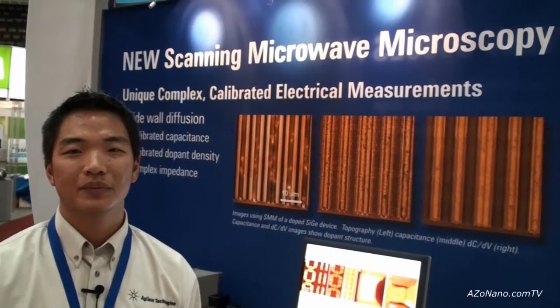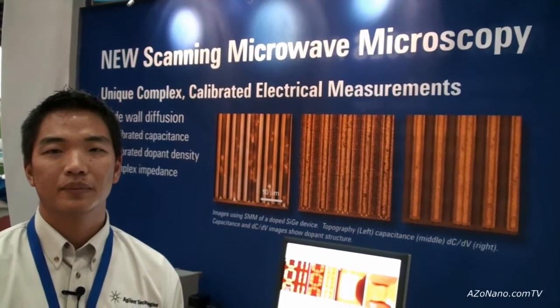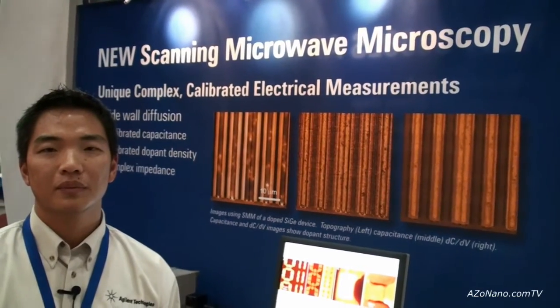This is Cameron Chai from azonano.com, speaking to Gil Min from Agilent Technologies, who is going to tell us about their new scanning microwave microscopy system.